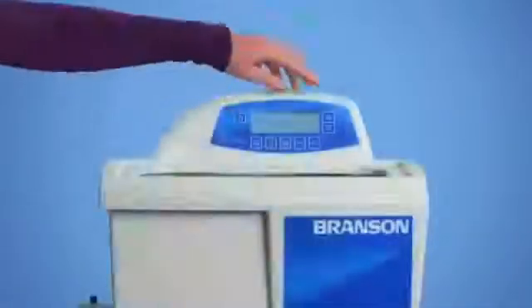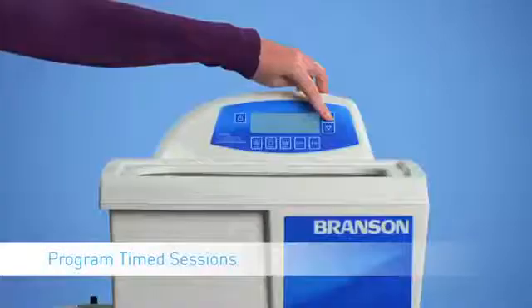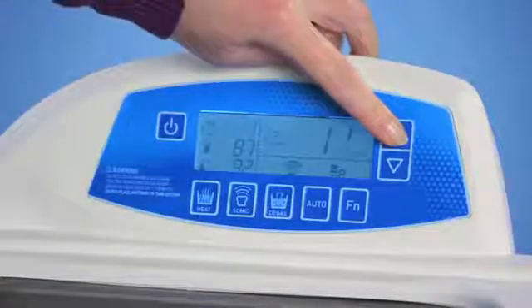Start by setting your cleaning time. You can choose timed increments of up to 99 minutes, or get the flexibility of continuous cleaning with a constant sonics mode. Either way, just set your digital Bransonic and forget it.